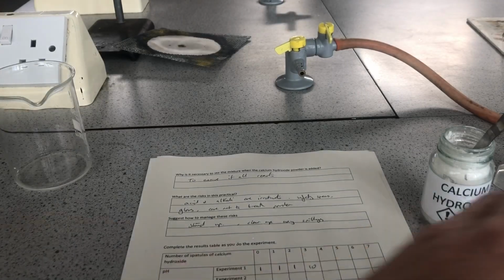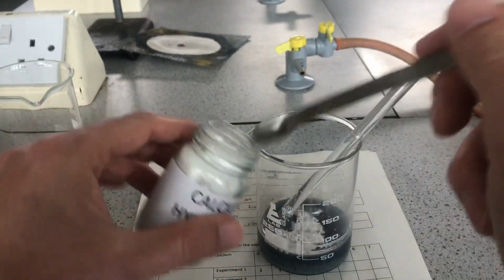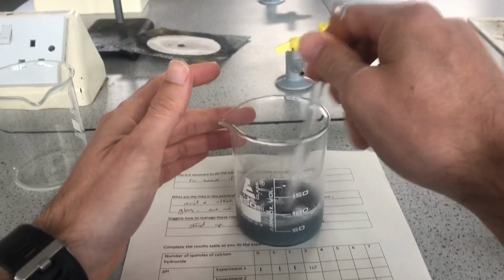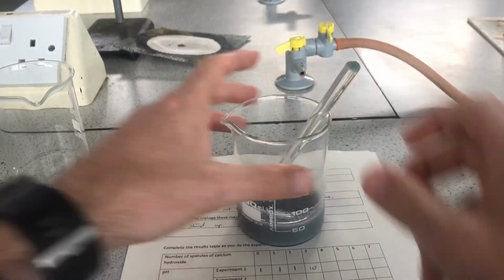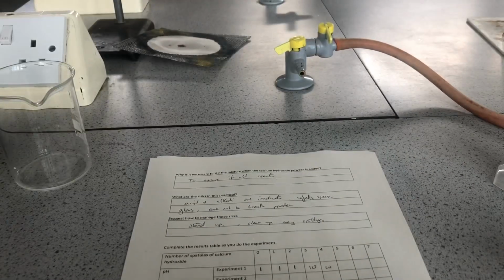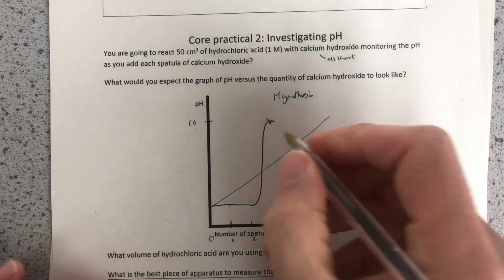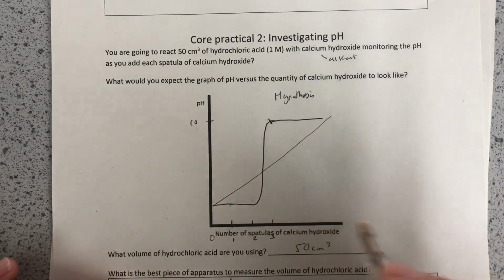Let's add another spatula and see if it stays there or changes any more. See if it gets any darker. So our fourth spatula, isn't it? Give that a good stir, and I don't see the colour changing at all as we stir that into the solution. So that's still pH 10. And what we have there now is a fairly classic pH curve. Let's just extend it out like that. So that's a fairly classic neutralisation.